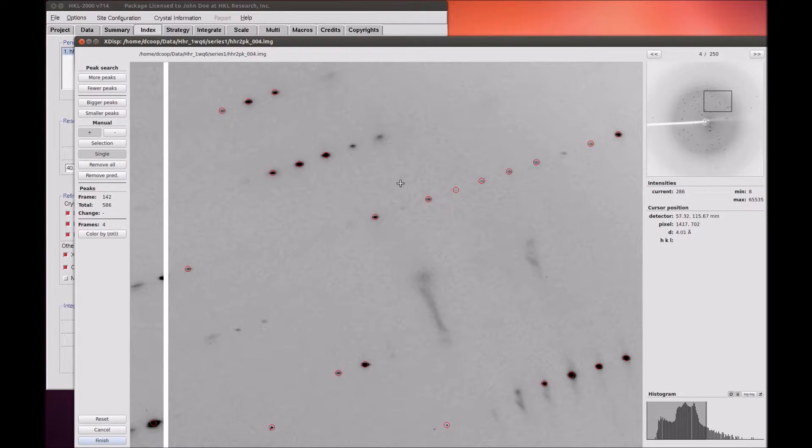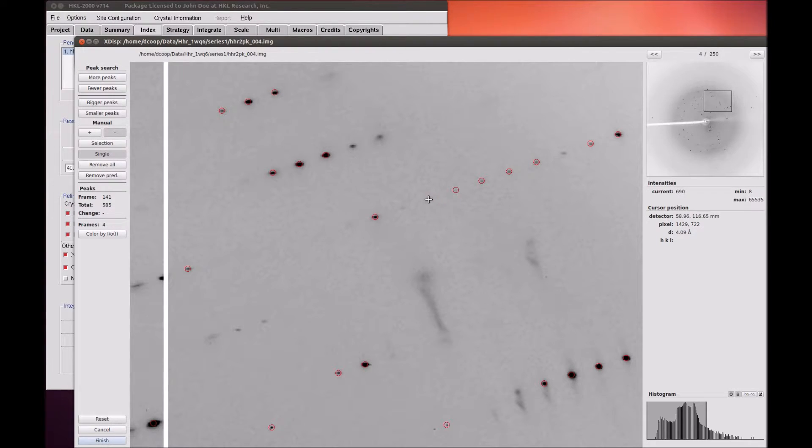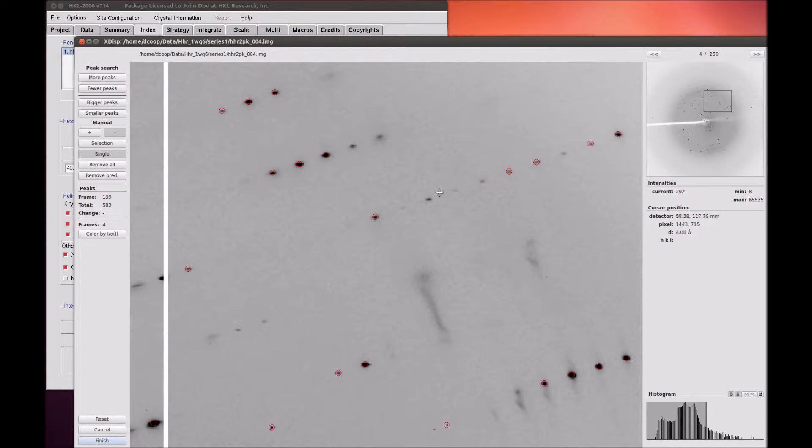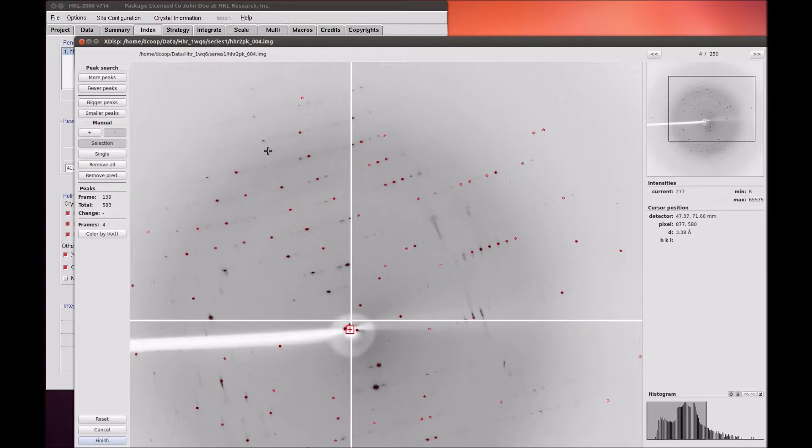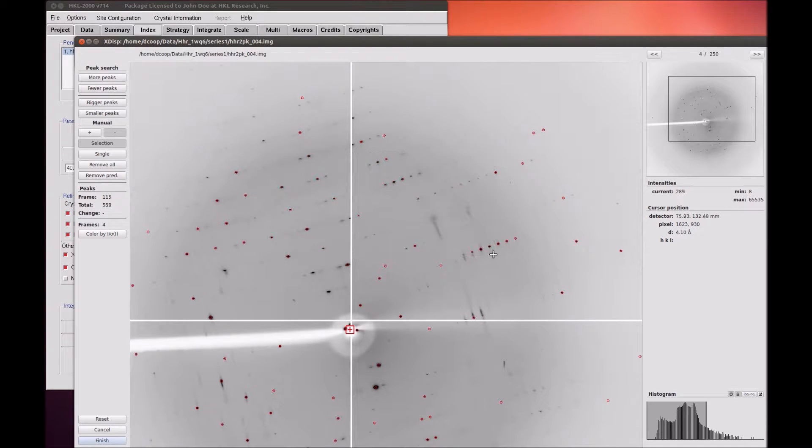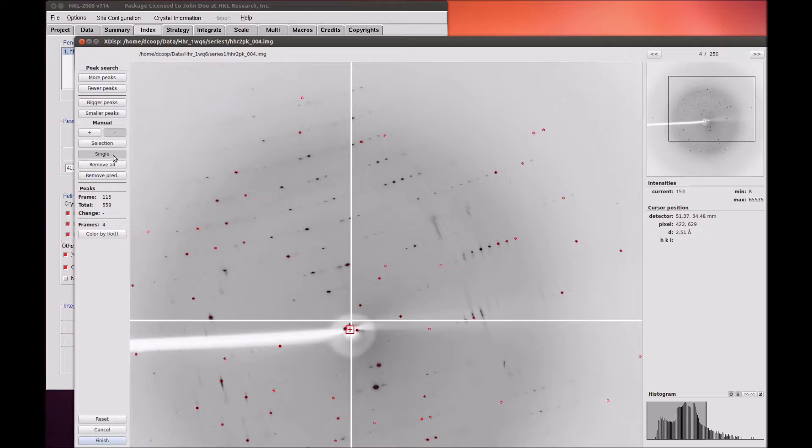With the Minus button, you can either remove reflections one at a time, or use the Selection button and click twice to define a rectangle of reflections that will be removed. You also have the option of removing all the peaks so you can start over, or by coloring the peaks by their intensity over sigma levels.